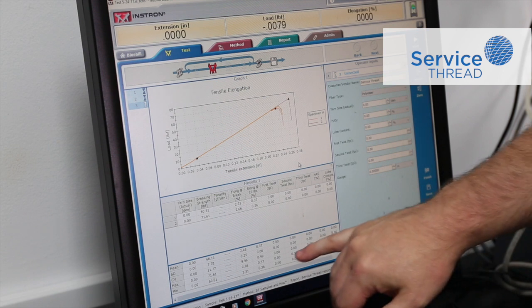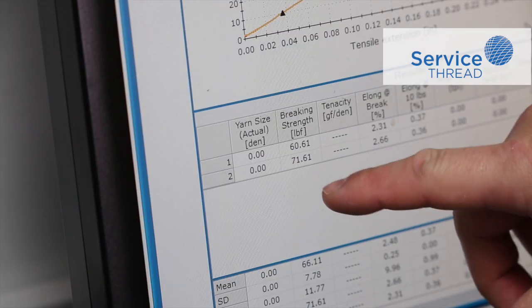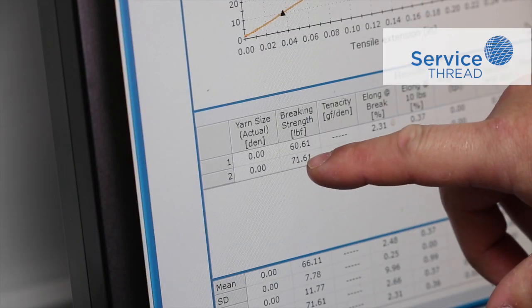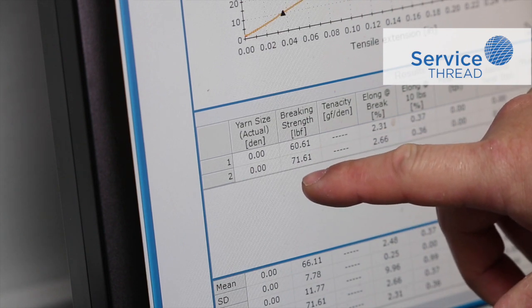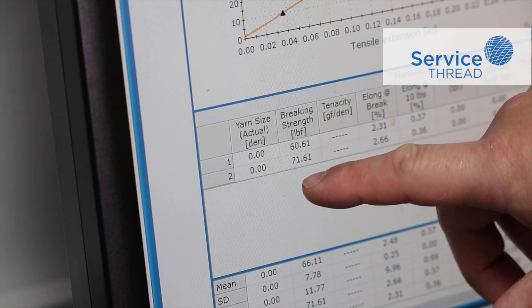Our results show the difference between the flat yarn and the twisted yarn. The flat yarn broke at 60.61 pounds, whereas the twisted yarn broke at 71.61 pounds.